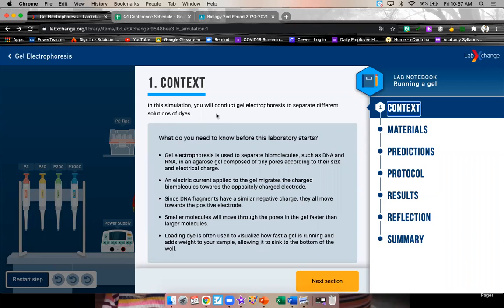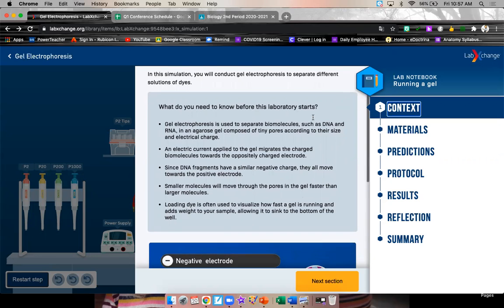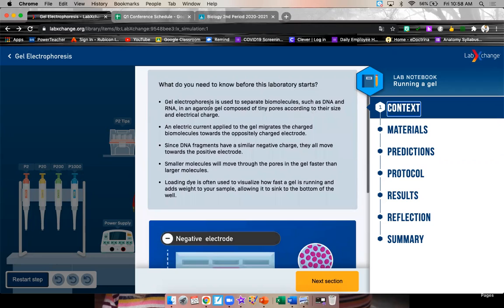In this simulation, you will conduct gel electrophoresis to separate different solutions of dyes. What do you need to know before this laboratory starts? Gel electrophoresis is used to separate biomolecules such as DNA and RNA in an agros gel composed of tiny pores according to the size and electrical charge.